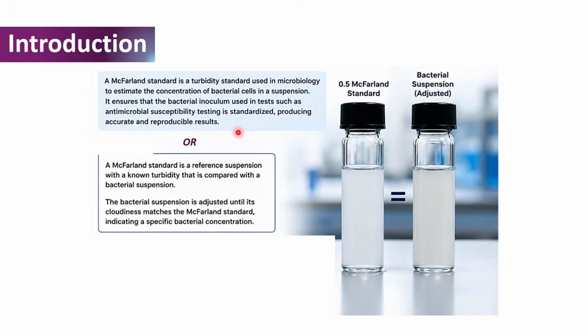Or we can also define the McFarland standard as a reference suspension with a known turbidity that is compared with a bacterial suspension. And what we have to notice is that the bacterial suspension is always adjusted until its cloudiness matches the McFarland standard to indicate a specific bacterial concentration.